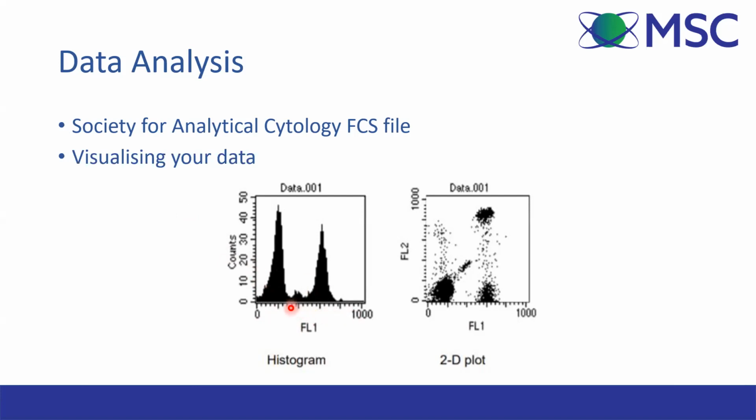On the y-axis of the histogram, we generally have a cell count. So the histogram represents the number of cells at different fluorescence intensity levels, from very low fluorescence here on the left, which are essentially negative, to strongly fluorescent over on the right-hand side of the histogram.